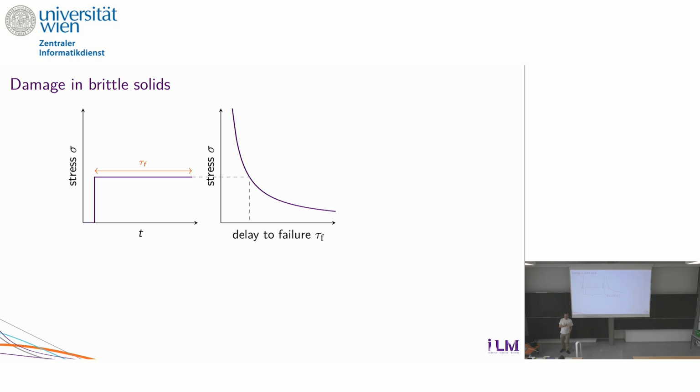So let's say you're a nasty scientist, I mean, borderline evil scientist, and you know that your colleague will be testing a sample tomorrow. You take the sample out of the shelf. This is a pristine new sample. You put that in your testing machine, and you apply a stress on it for, let's say, 1 hour. It doesn't break. You put it back on the shelf. You tell nobody. Then your colleague comes the next day, takes the same sample, and it breaks in 1 hour.